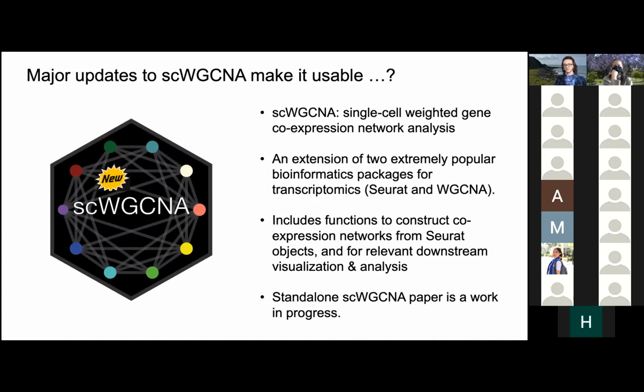I think previously with WGCNA, it's much harder to figure out. A lot of the plotting that you see with WGCNA is all custom code. It's not functions that they give you. There are tons and tons of settings for WGCNA, and I tried to pare down the amount of things you can change here.